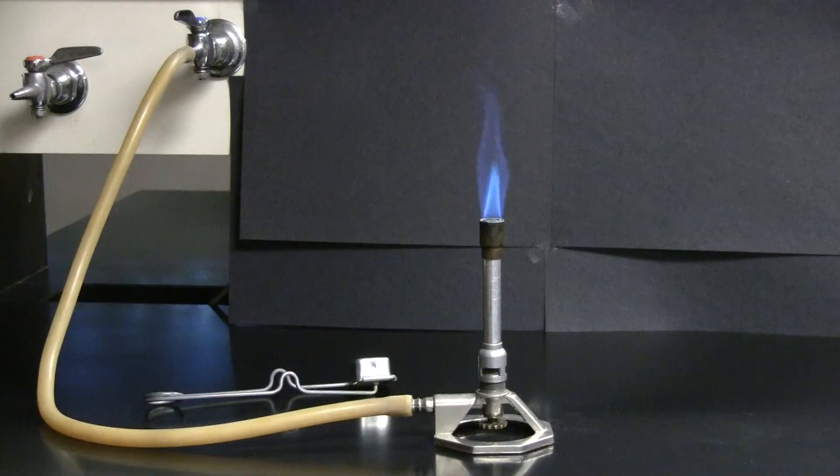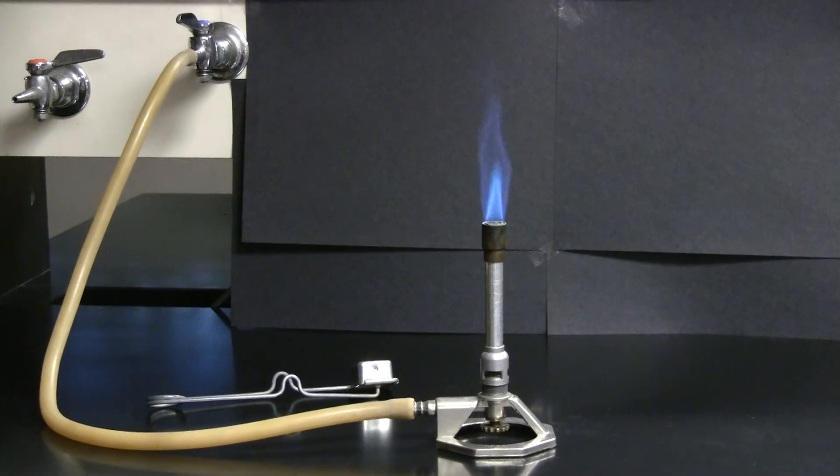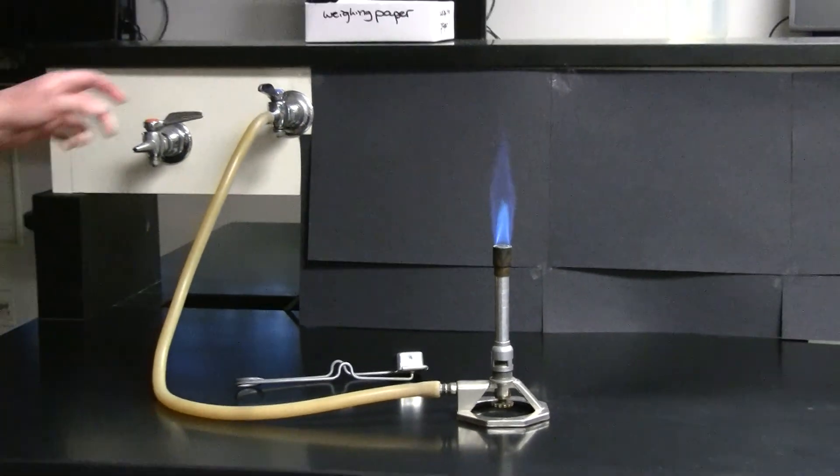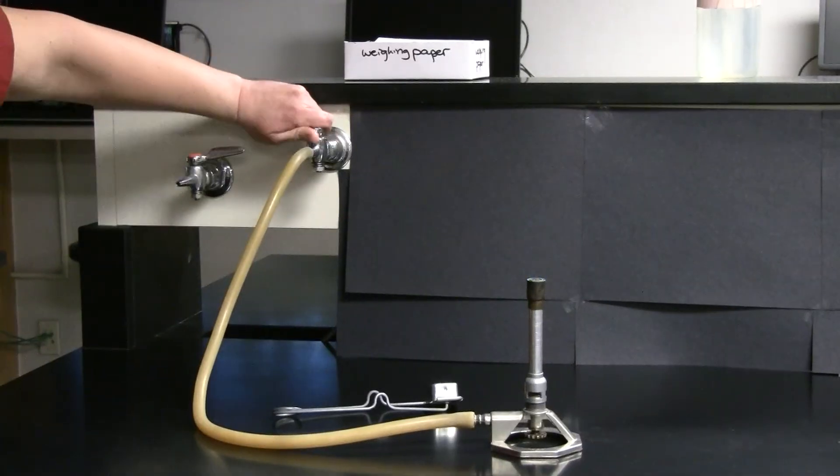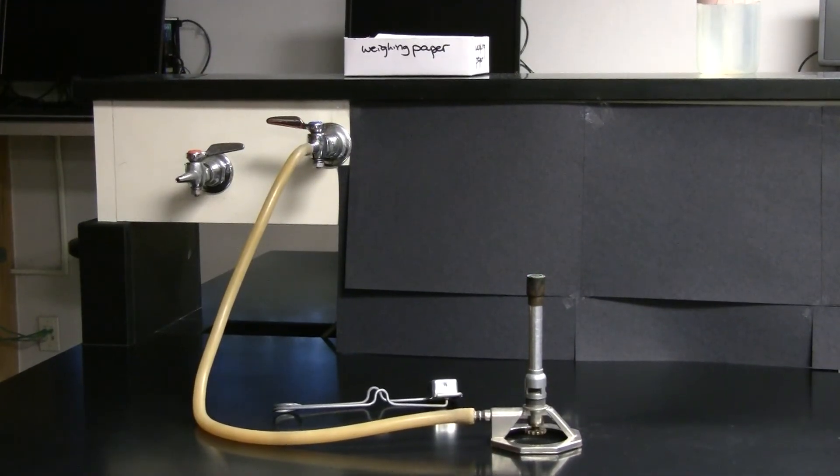Finally, when you are done using the Bunsen burner, turn off the Bunsen burner by turning off the gas valve at the bench. Wait for your Bunsen burner to cool and then close both the air inlet valve and the gas valve before putting it away.